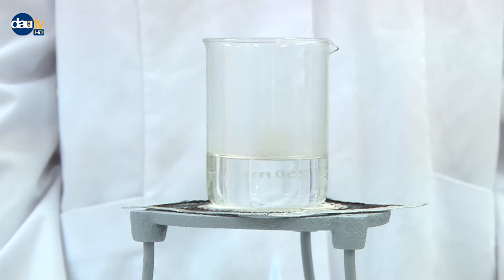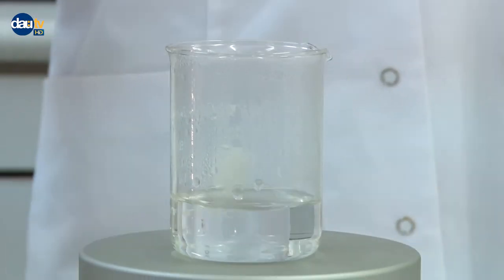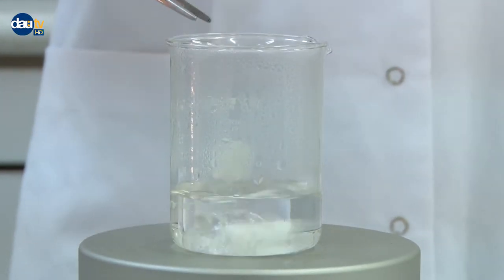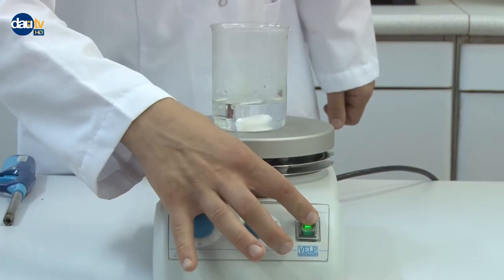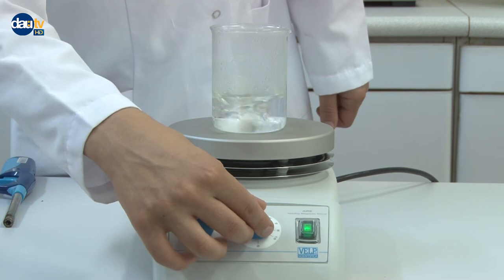Heating a liquid in a beaker by hot plate magnetic stirrer. Simply put the beaker containing the liquid over the plates with the magnetic stirring bar, open the heater, and adjust the stirring speed. Adjust the desired temperature from the temperature control knob.